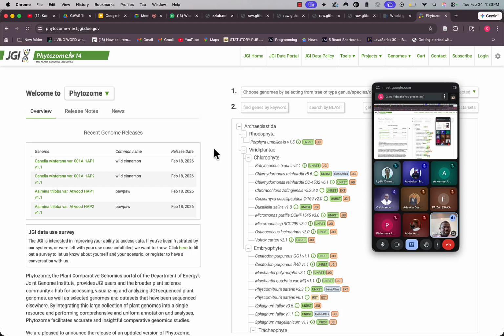model. Now, we are not doing all of those things manually because GAPIT does all of those things behind the scene. We just have to provide the files to it. But if you are using some other software like LDAK or PLINK, you might have to run each of these steps manually and then get the results and then use that for your GWAS. Yeah.